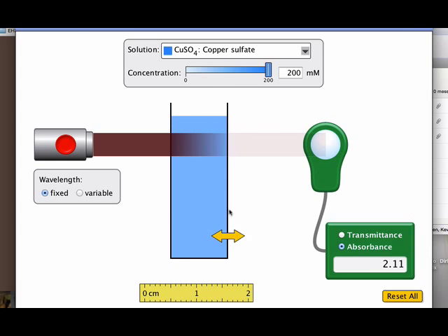The beauty is, again, we're going to use the same cuvettes for everything, so that's a variable that we can kind of eliminate from our process. And we're only going to use one chemical, so that's another variable we can eliminate from our process.